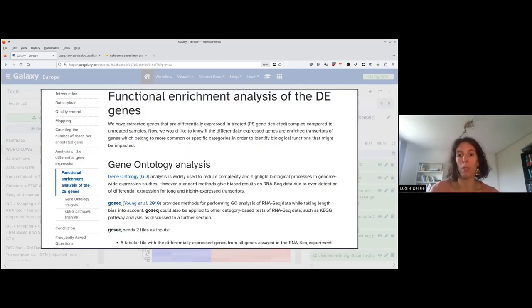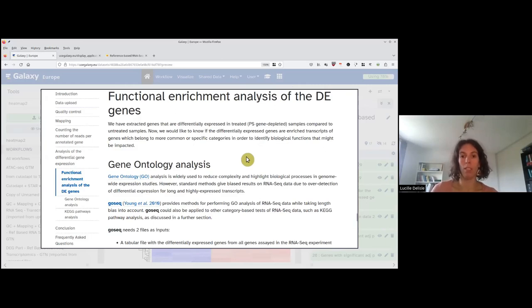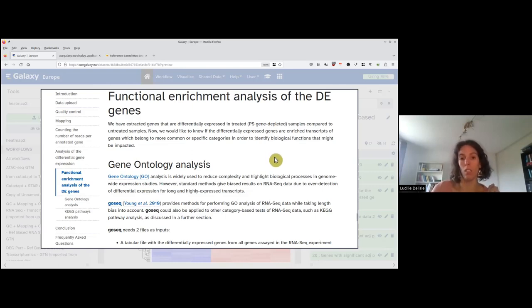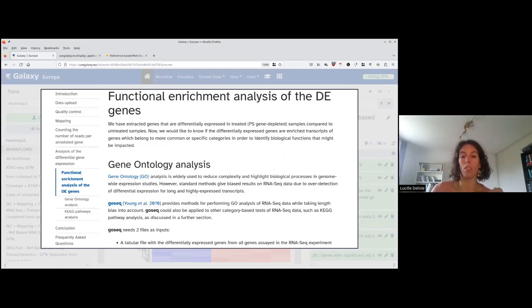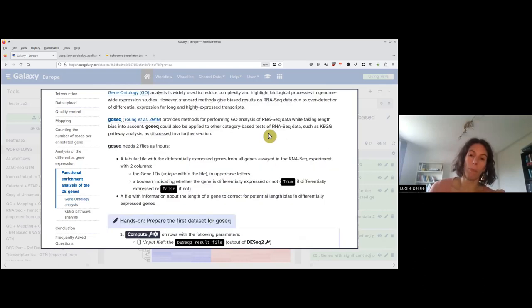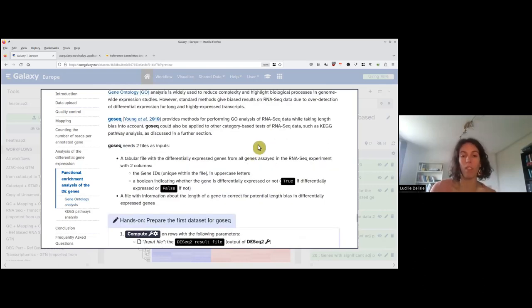When we selected the significantly differentially expressed genes, we had a list of genes, and sometimes you want to know if they have common features. This is what we call gene ontology — are they associated with common biological processes or cellular compartments? We will do this analysis using a tool called GOSeq, which allows this type of analysis.